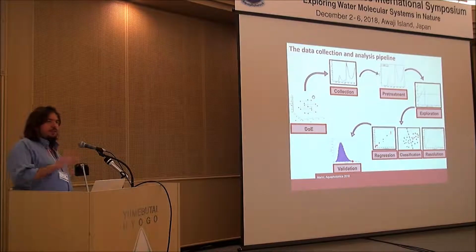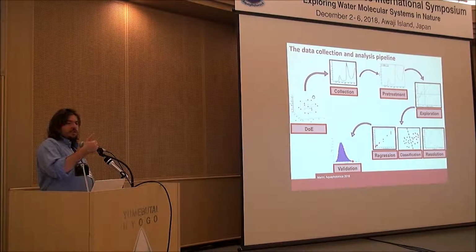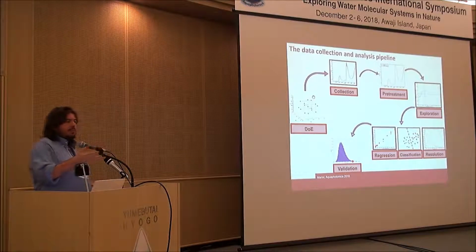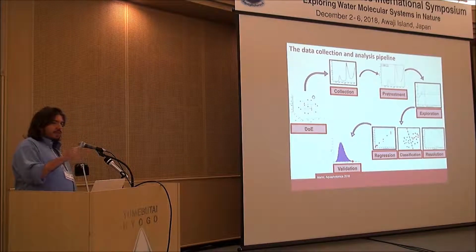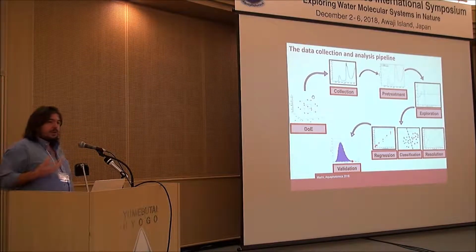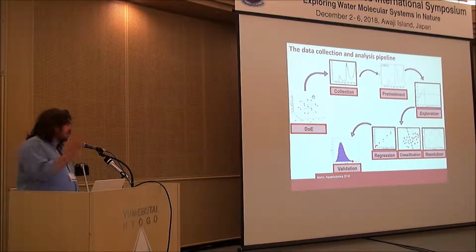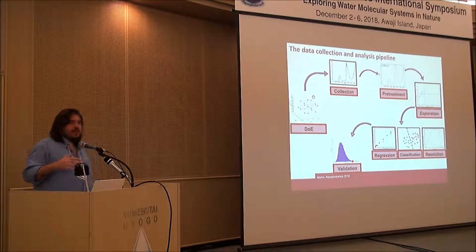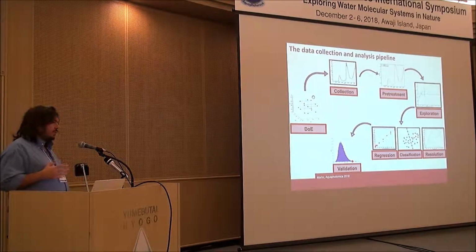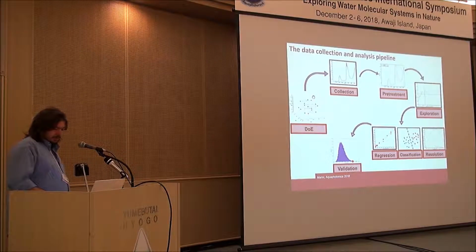But validation is a general concept that involves validation of the underlying hypotheses of the models that we're using, of the stability of the extracted profiles, such as the loadings, even when they are unsupervised, and in general of all the considerations, of course including predictive ability but not limited to it, that we make once we are building our models.